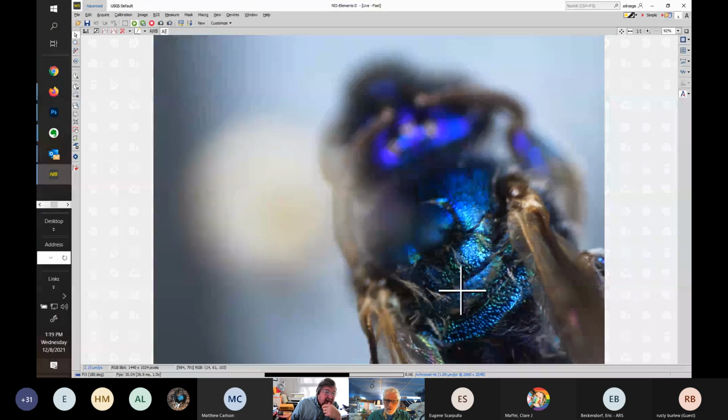So here's a metanotum, and this distance here to here is less than this distance from here to here. That's how you do a lot of measurement in bees, relative to something else rather than trying to actually come up with a measurement, because sizes vary. And this is skinny all along. Yep, it's basically a band. This is my impression. And now, no, I agree completely.